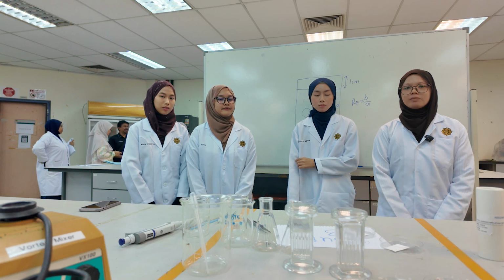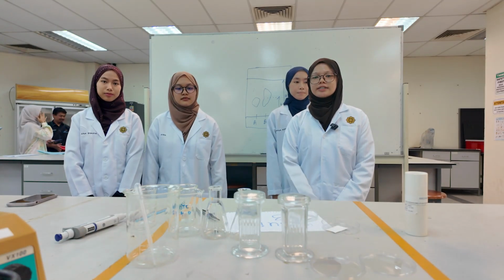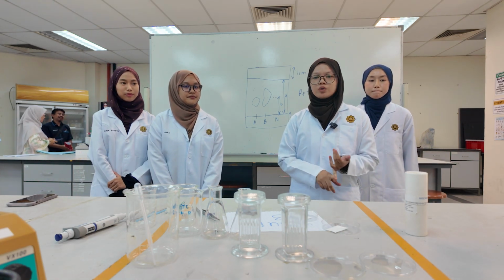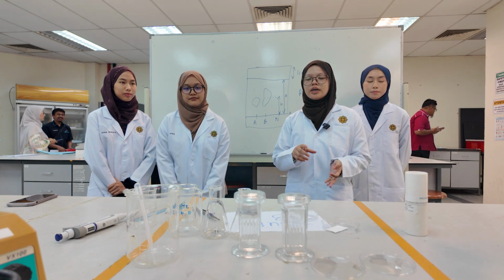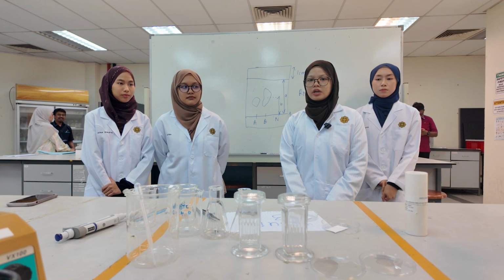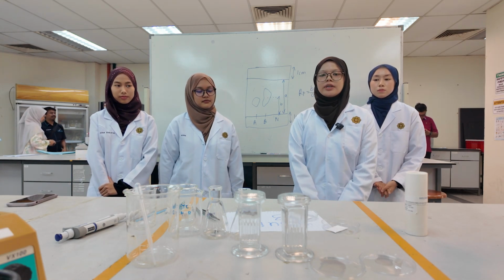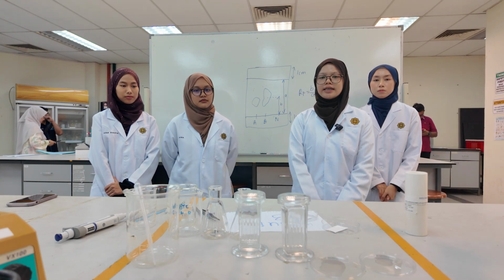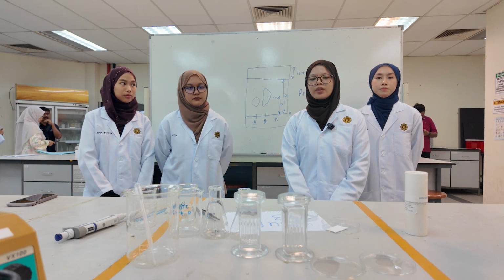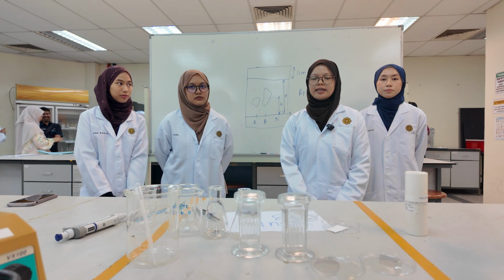Assalamualaikum and hi, I am Amila Husna binti Shariena. I will explain about health and safety precautions on TLC experiments. The first one is we need to make sure that we wear lab coats, closed shoes, and gloves before starting the experiment. This is because we will be dealing with harmful chemical substances such as dichloromethane, which might irritate our skin and eyes. So by wearing a lab coat and all, it can help prevent any harmful chemical spillage onto our skin.